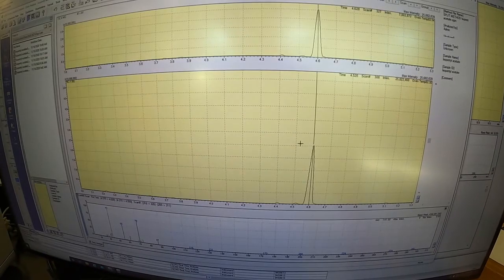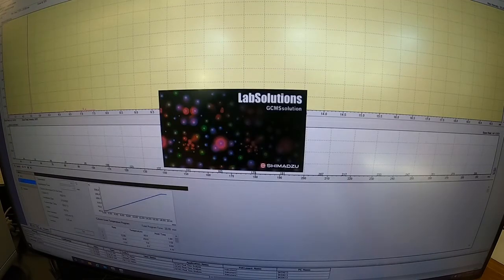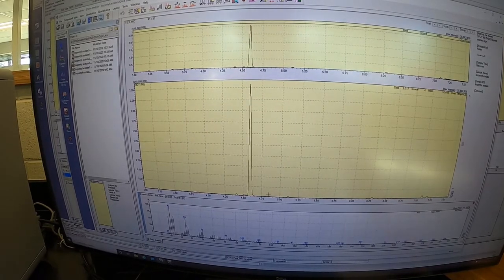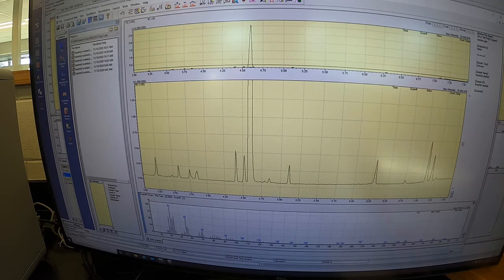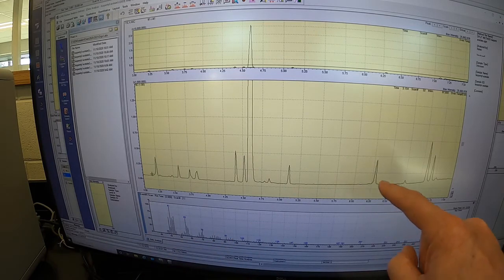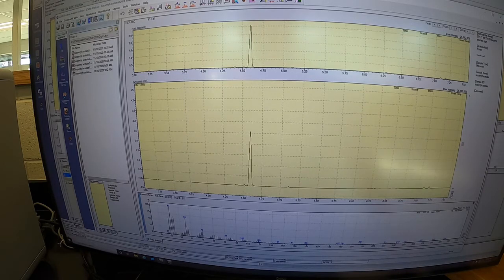I'm going to go back to the gas chromatograph side of the spectrum, and again, here's the original GC spectrum showing that one big peak in the middle that's filling up pretty much the whole entire screen. And if I zoom in, I can see that there are a variety of smaller peaks. So these small peaks would commonly refer to some kind of impurity that were probably in the solvent. And because they're so small relative to the main peak we're looking at, we can say that the purity of our product is very good.